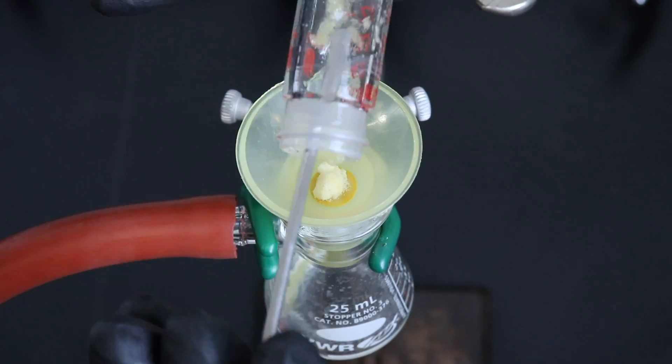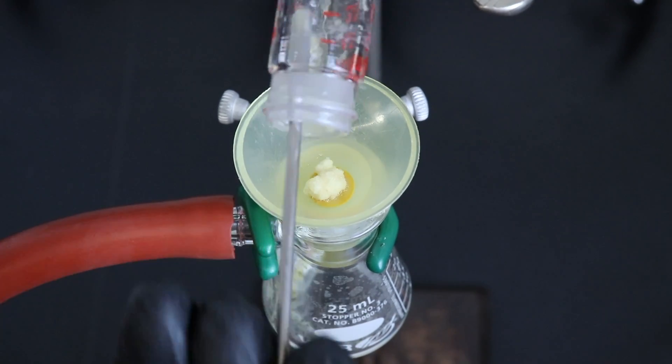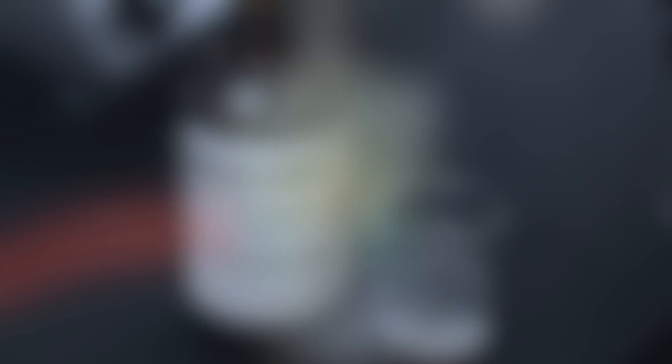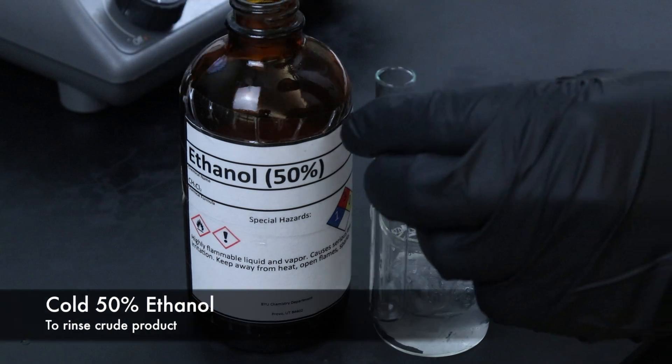The product can then be moved over to the Hirsch funnel to separate it from the solvent and I'll be rinsing it with some cold 50% ethanol.